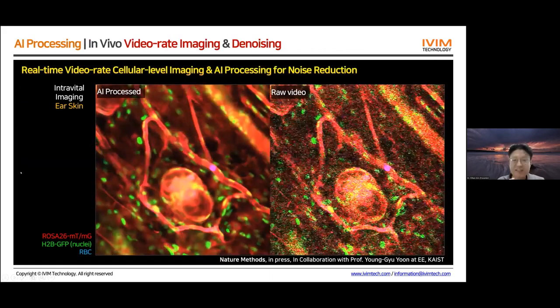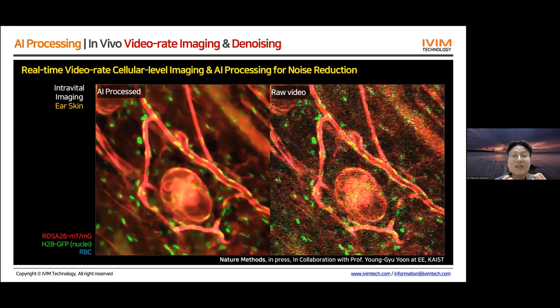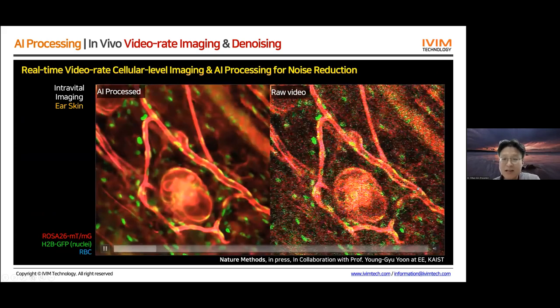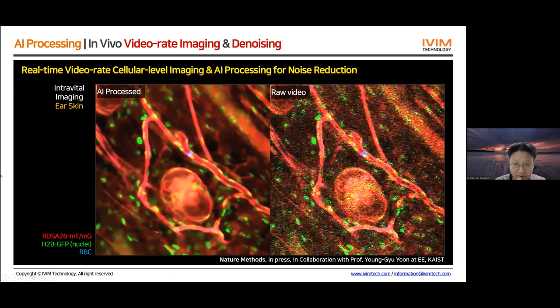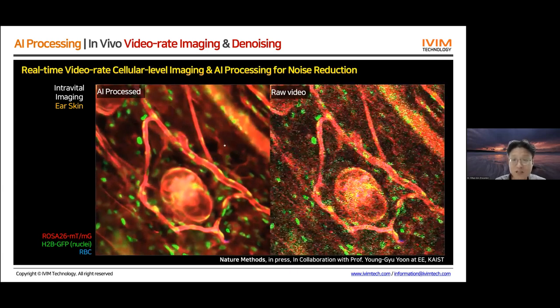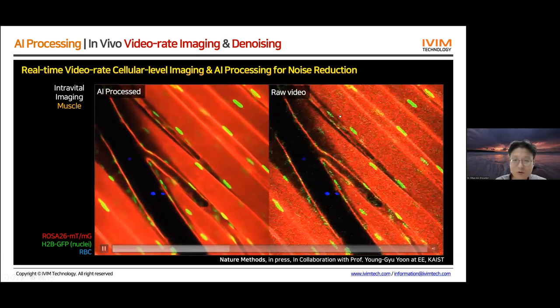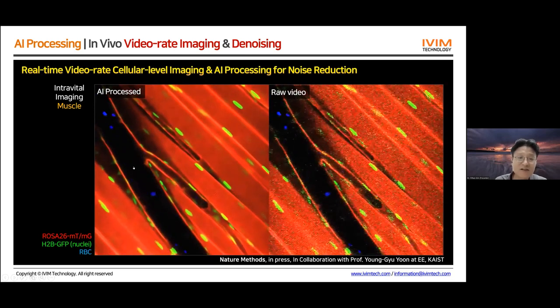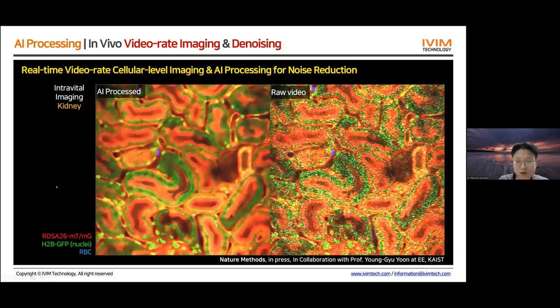Our work published in Nature Methods introduces an AI processing model for denoising real-time video. On the right is the raw noisy video in real time, and using our new AI processing technique we very efficiently and effectively remove noise from the live video. This is another example showing the raw video, then the denoised video — clearly revealing rolling cells in a vessel obtained from muscle — and another example from the kidney.